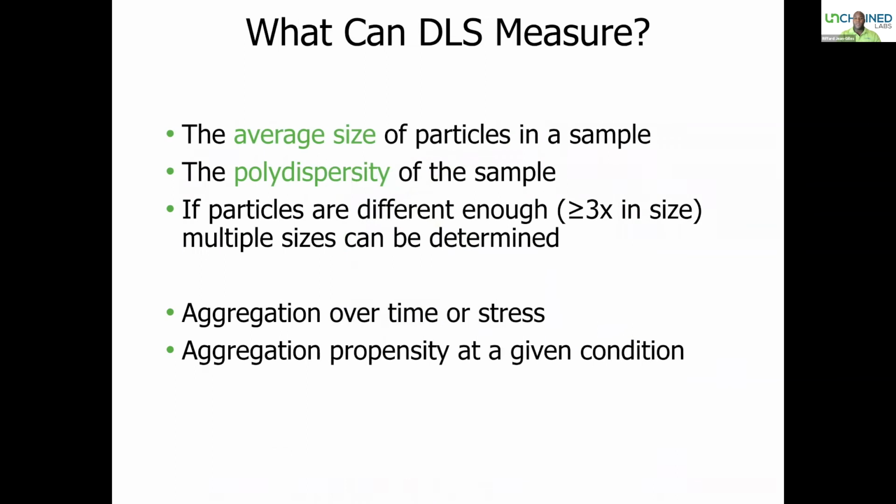So some of you may know what DLS is about, but briefly, I'm just going to remind you, right? So DLS essentially is about looking at size of your particles, but also polydispersity. So that second term there, polydispersity, is a way of thinking about homogeneity, right? So how many of my samples are going to be close to the size I'm expecting, but do I also have a second or third size population or group in my sample? And that's essentially what we are trying to assess.